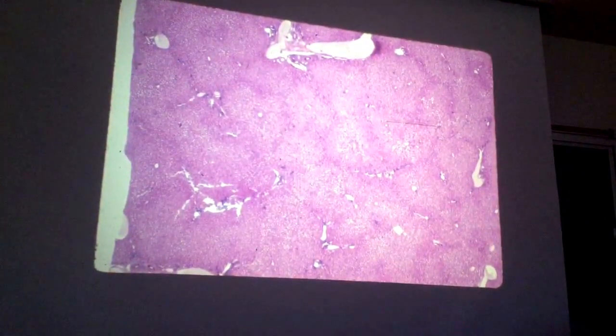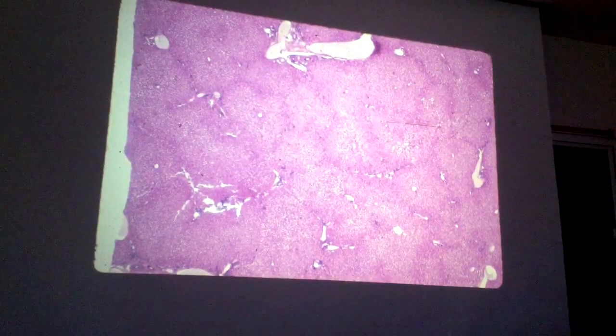And what is this organ? Liver. Very good. Okay, and that structure right there is what? Central vein. And what are these spaces we see right in there? Sinusoids. And all of these cells are what? Hepatocytes.